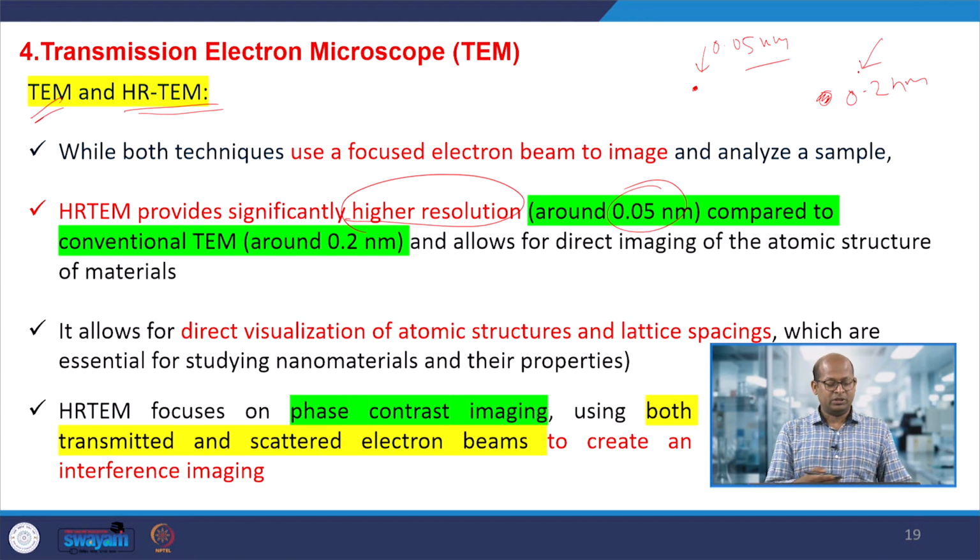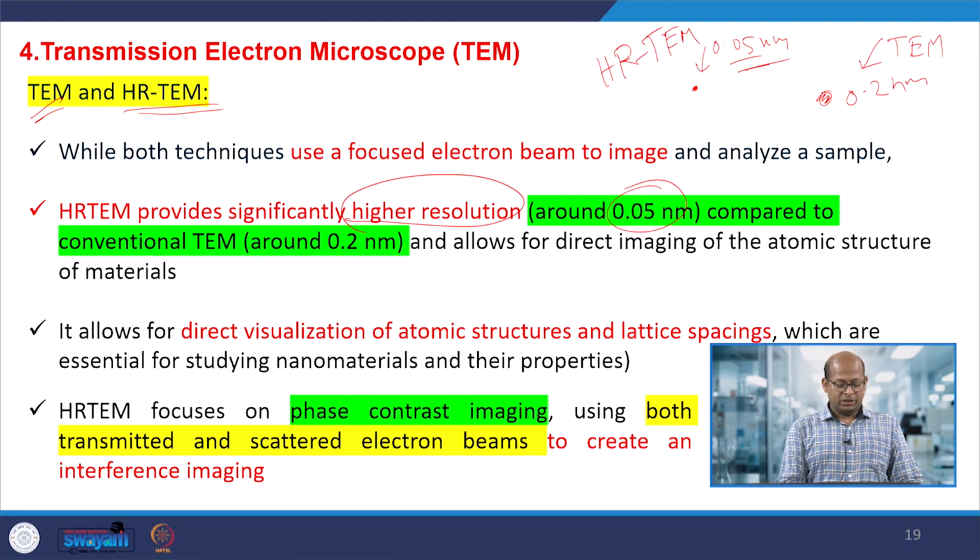So to get good resolution of the materials we have prepared, we go for HR TEM, through which we can visualize the atomic structures and lattice spacings.